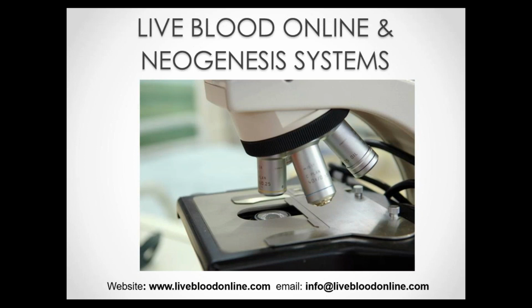He argued that all hematology labs should consider changing over from analyzing stained blood samples to live samples, mainly because with live samples you are able to observe in real time the dynamic processes of life at the cellular level. He said that you can capture events and sequences that are impossible to see in static, dead, and stained slides, and this is certainly something that we see in practice every day.